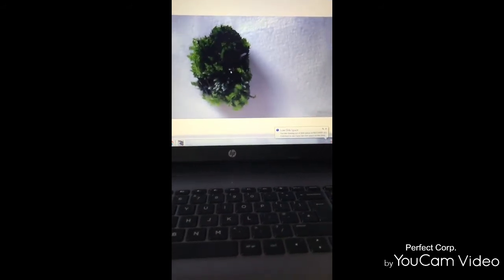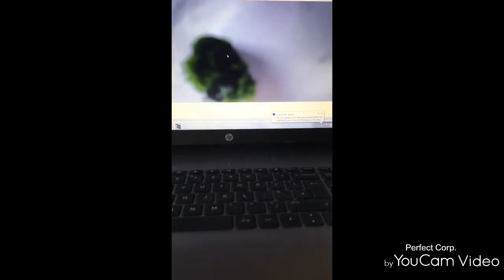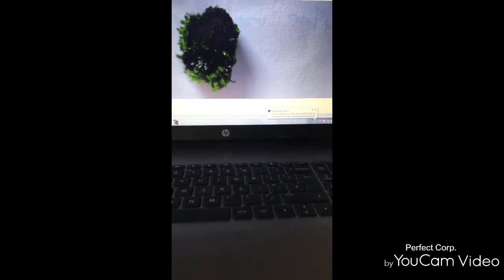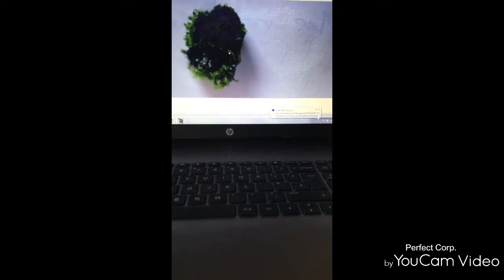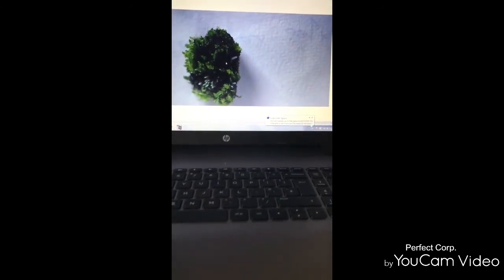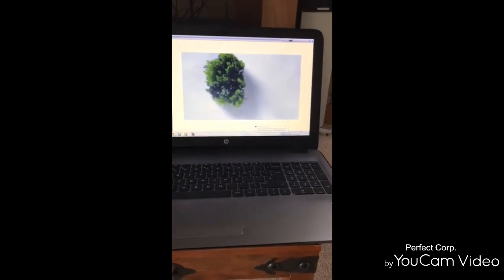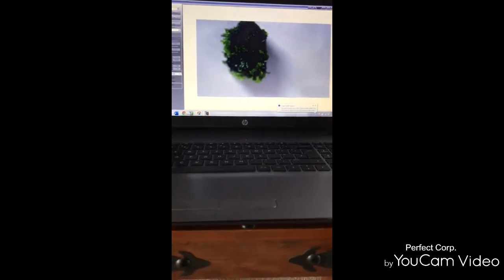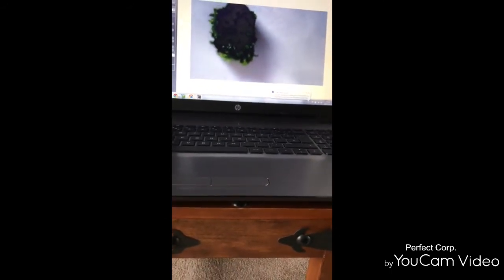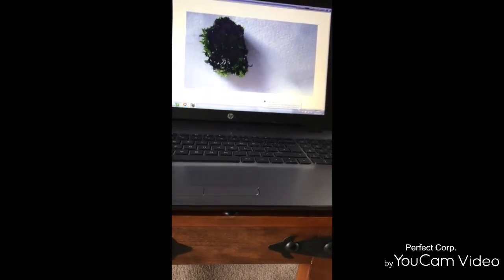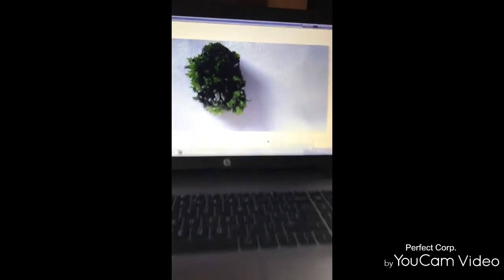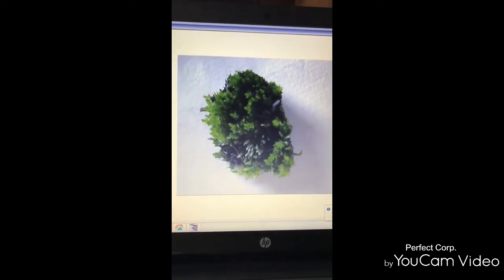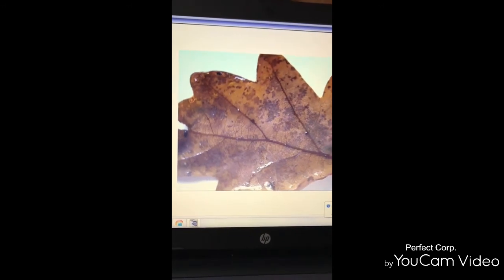And you can focus by turning the black middle piece. This is a piece of moss that I've just got out of the garden. This is a leaf.